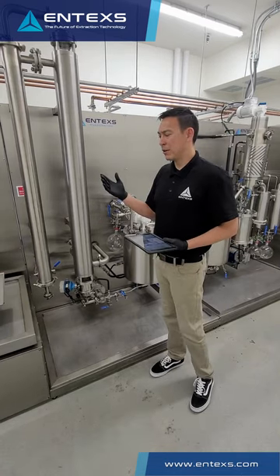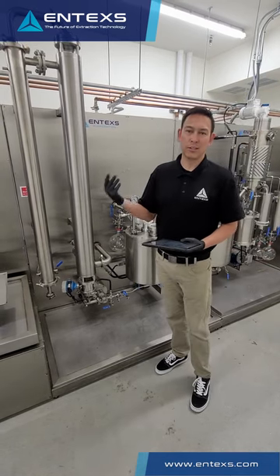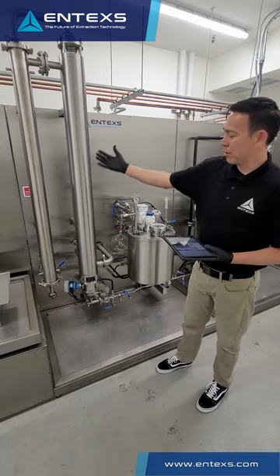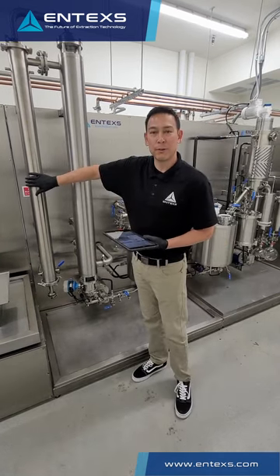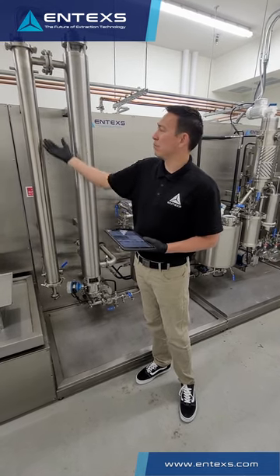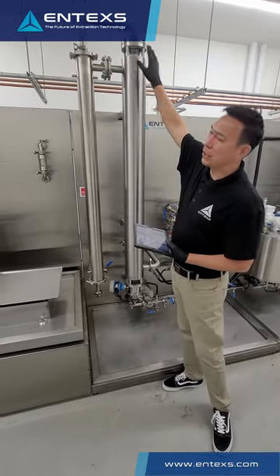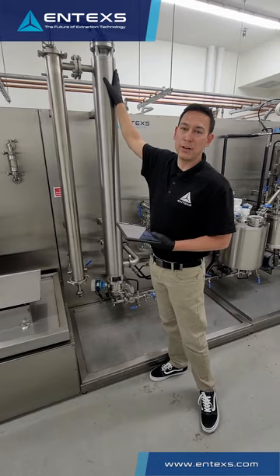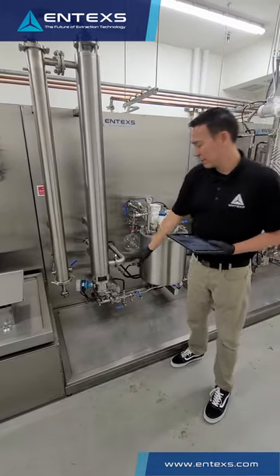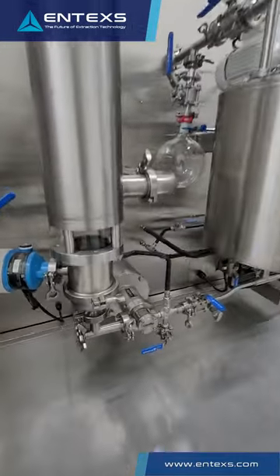The second part of the process utilizes the Entex evaporation module. What this does is separate the solvent from the oil collected in the extraction. This solvent is run through first a rising film evaporator, which starts increasing the concentration of your tincture as it rises up the heat exchanger. It then comes into the falling film evaporator, which does most of the evaporation work, removing most of the solvent from your oil. What you're left with at the bottom of the falling film is a concentrated crude oil.